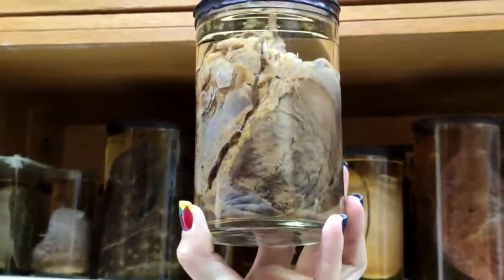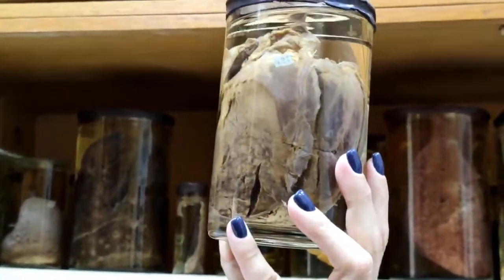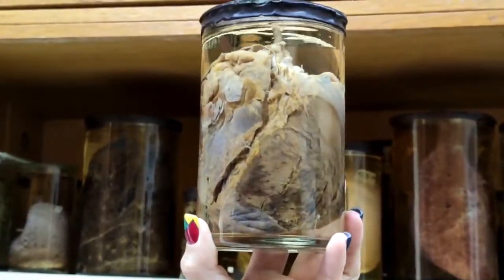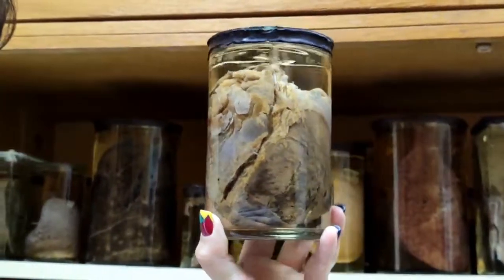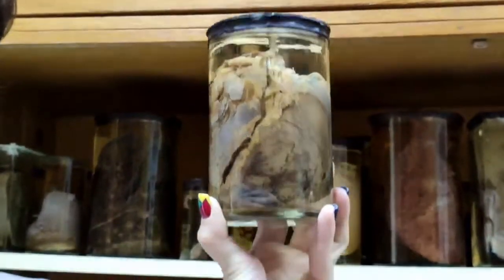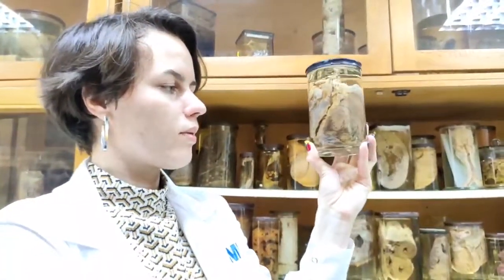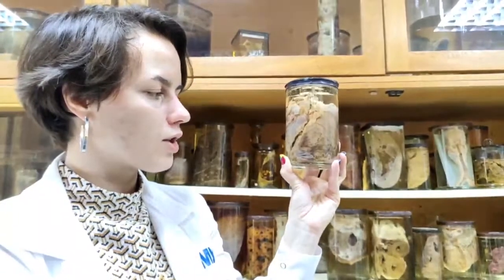Infarctions are divided by their color and by the shape. So myocardial infarction has white color, white with hemorrhagic corolla, so-called hemorrhagic corolla, because infarctions are white, red, and white with hemorrhagic corolla. And you should remember that this third special type is of myocardial infarction.